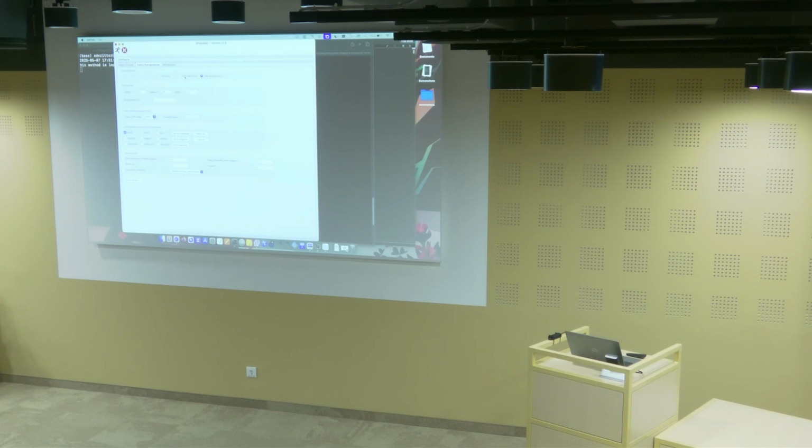We can run it in the fast and furious mode, and in this way, specific parameters are basically disabled, so we will use default values for quite some things. And if you just want to calculate a Fourier difference map, you can just run it in FOFO only mode like this. And it basically will be finished in a minute or so.